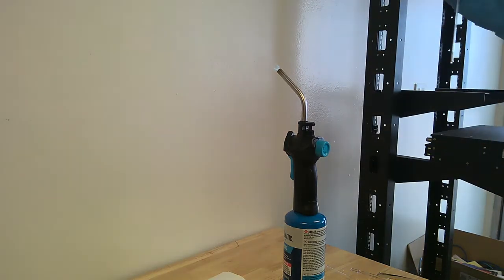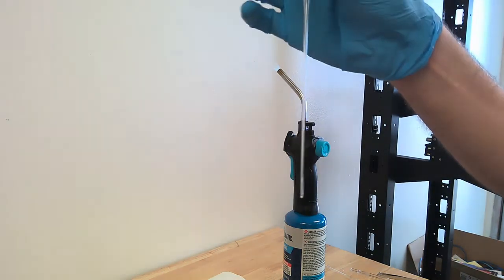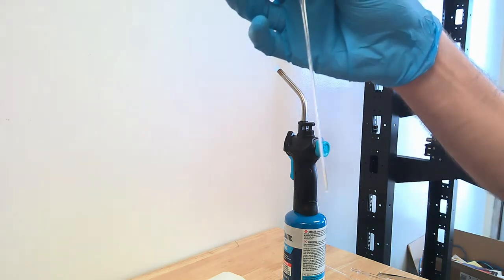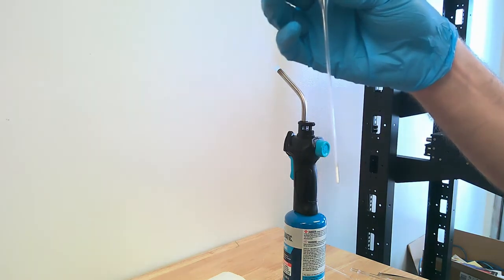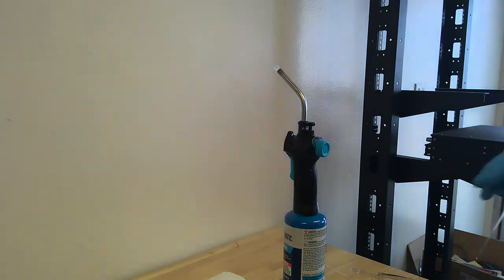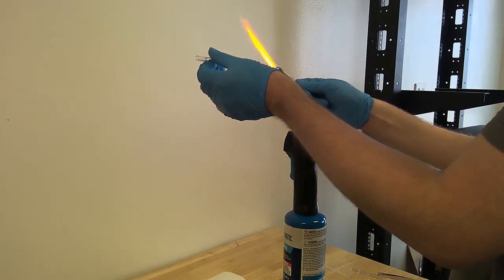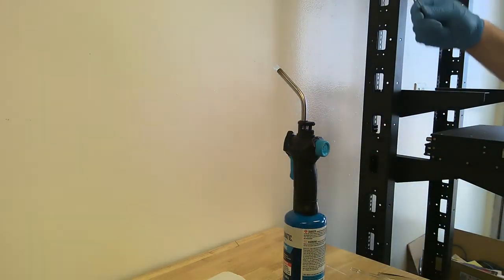So as we allow our picnometer to cool, we're going to take our cooled down stir bar precursor, and we're going to taper off the opposite end of the stir bar in order to generate a complete glass and metal stir bar. This can be used for organic reactions. So we're going to very carefully heat the end closest to the tip of the stir bar, and we're going to allow it to seal.